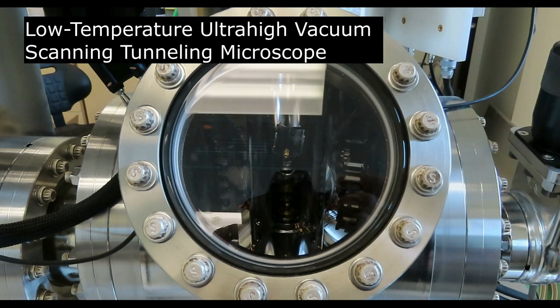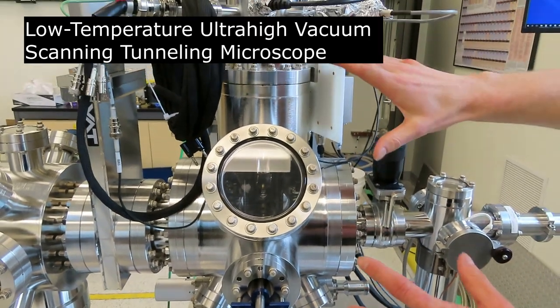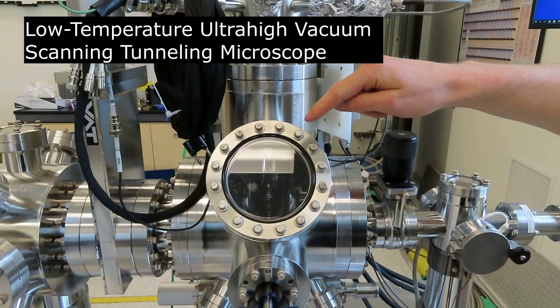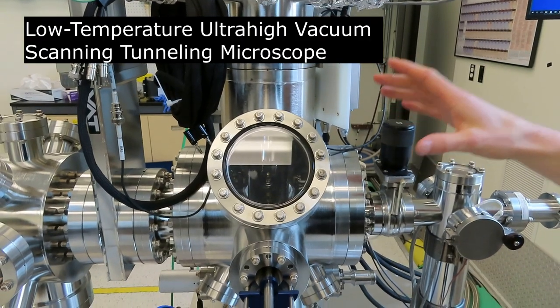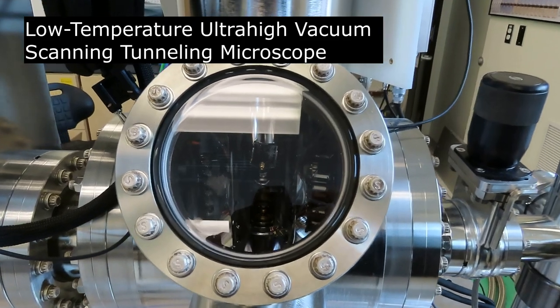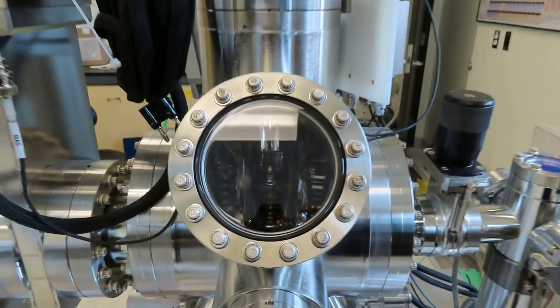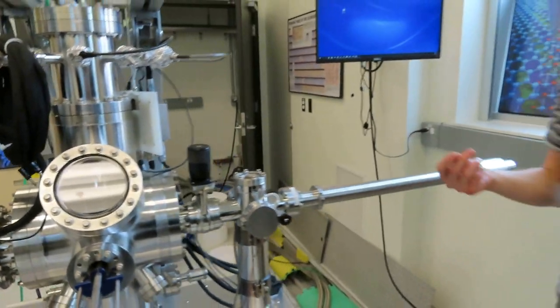This particular instrument is a low temperature, ultra-high vacuum STM. You see we have this big metal case with a little window you can look through. Inside the case, the pressure is very low—right now we're at 5.5 times 10 to the minus 10 torr. That's extremely low pressure, because atmospheric pressure is 760 torr, so that's a trillionth of atmospheric pressure.